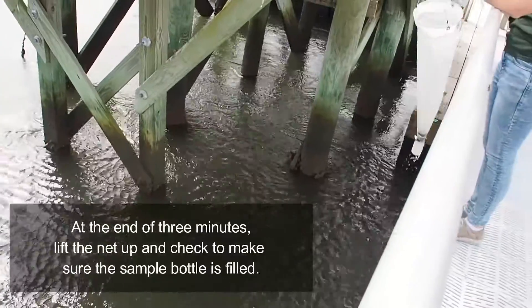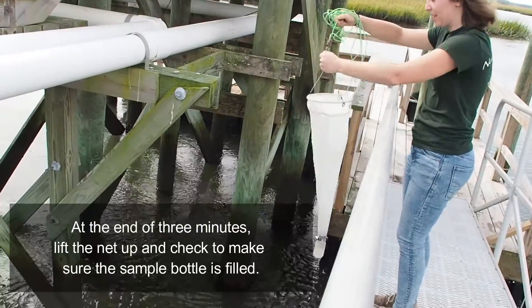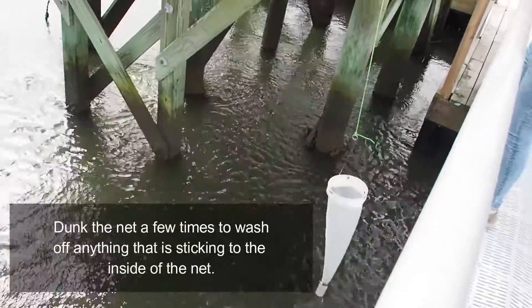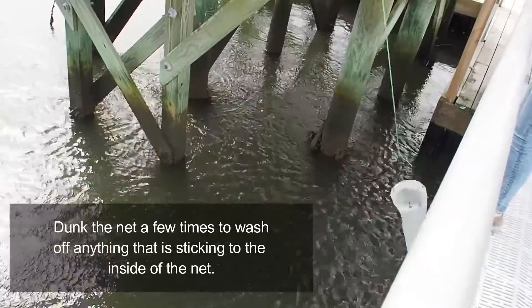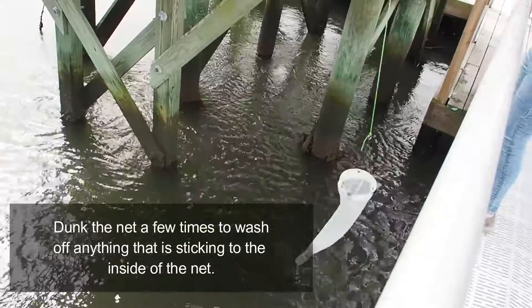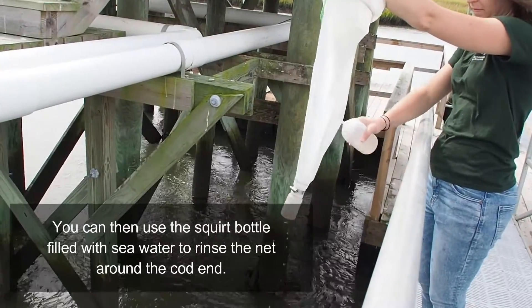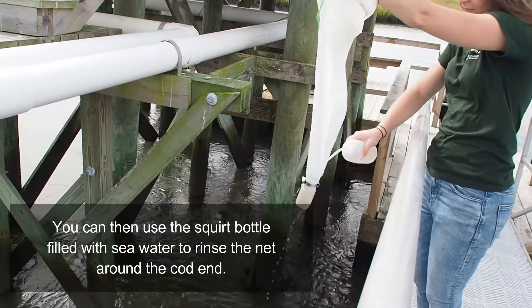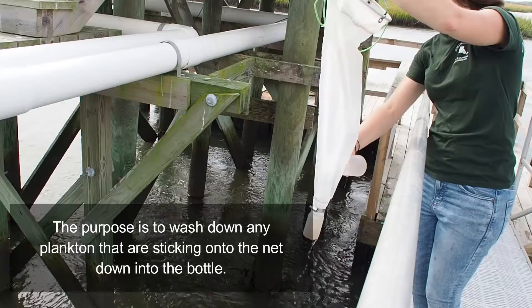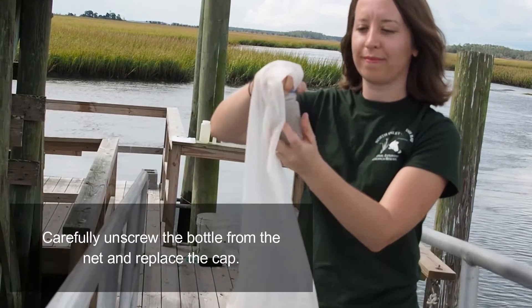At the end of the 3 minutes, lift the net up and check to make sure the sample bottle is filled. Dunk the net a few times to wash off anything sticking to the inside of the net. You can then use a squirt bottle filled with seawater to rinse the net around the cod end — the purpose is to wash down any plankton sticking to the net into the bottle. Carefully unscrew the bottle from the net and replace the cap.